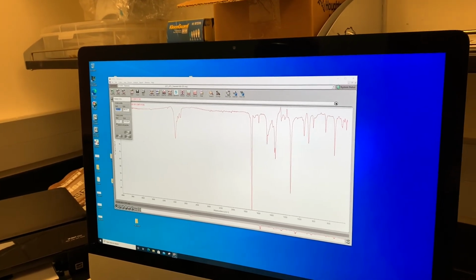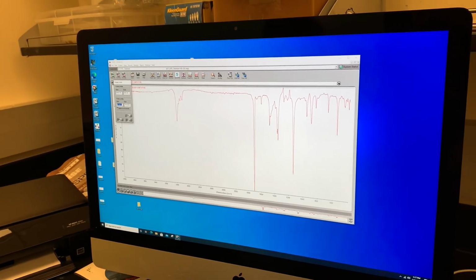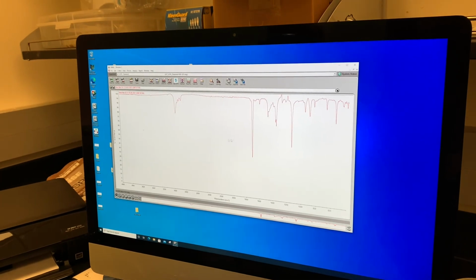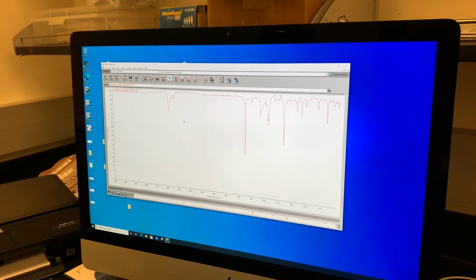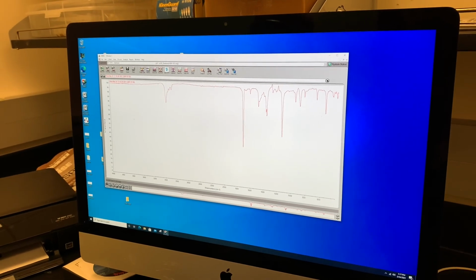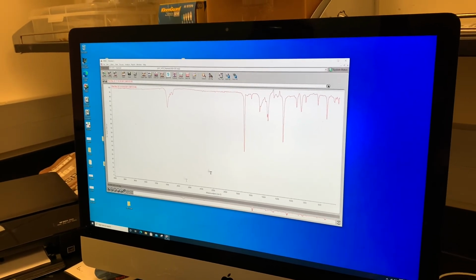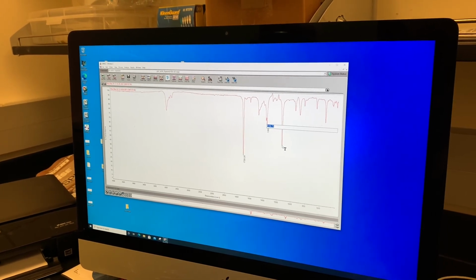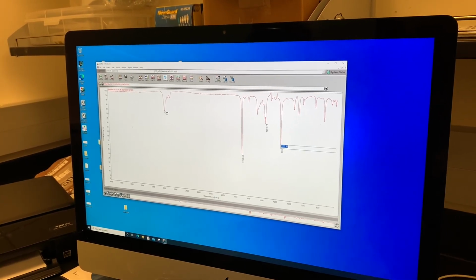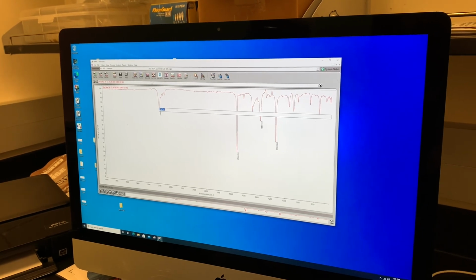If the IR looks clean, if it doesn't have any kind of weird peaks in it, it looks really nice. This is a really good looking IR. And so just based on the clean appearance of the IR, I'm going to assume that this is pure. And that means I'm not going to measure the boiling point. It's a very pure looking IR.